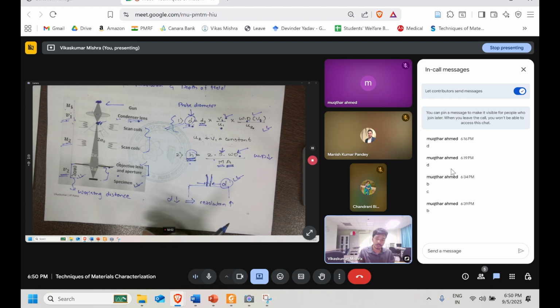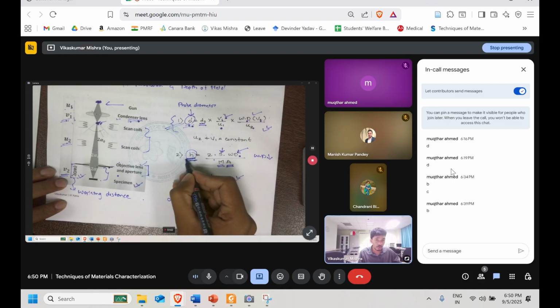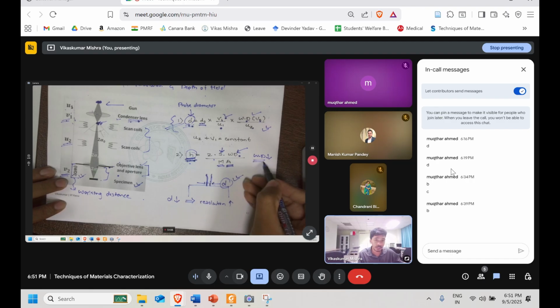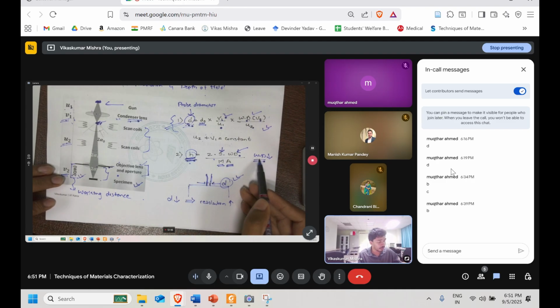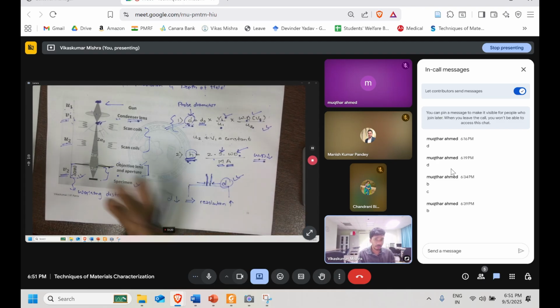Now, let us say someone wants to do fractography. Fractography usually has a very rough microstructure, with a lot of hills and valleys. In that case, you know that you want more depth of field, you want to focus a lot, so you will increase the working distance. Now, both things are there. If you increase the working distance, your resolution will go down, but your depth of field will go up, right? So one needs to play based on their material, and the optimization is always needed.